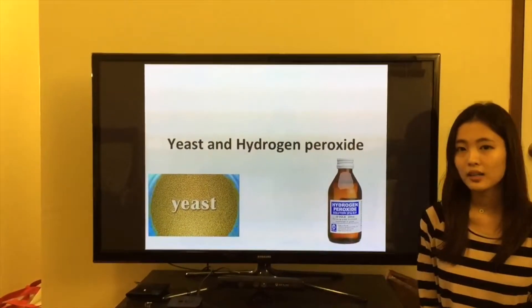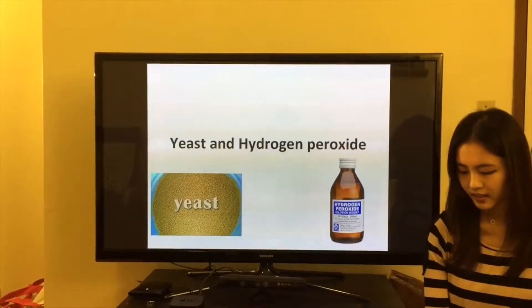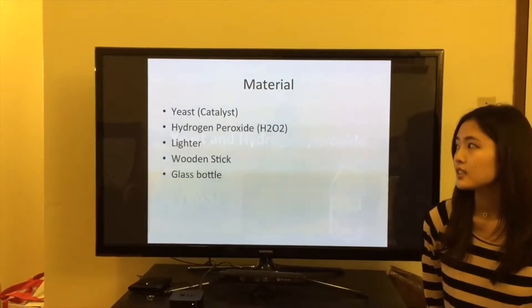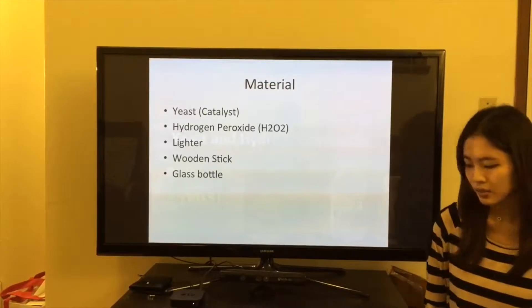This is Tiffany. Today I'm going to talk about yeast and hydrogen peroxide. The materials are yeast, hydrogen peroxide, lighter, wooden stick, and glass bottle.